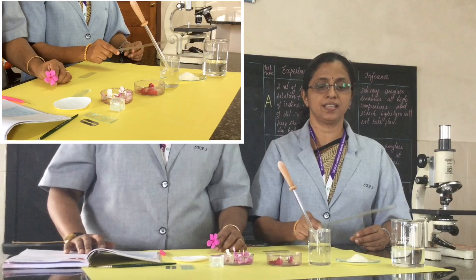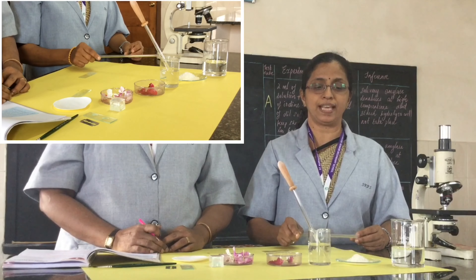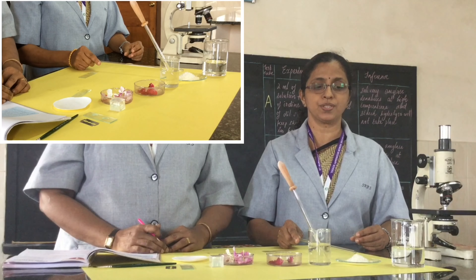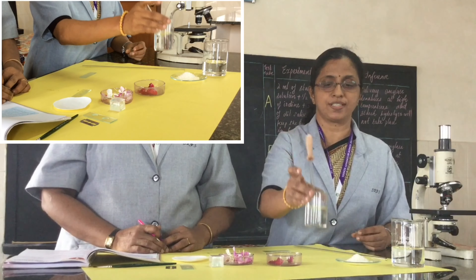The materials required are water and sucrose. We have to prepare the nutrient solution. For that, we take 20 grams of sucrose and dissolve it in 100 ml of water. This is the freshly prepared nutrient solution.